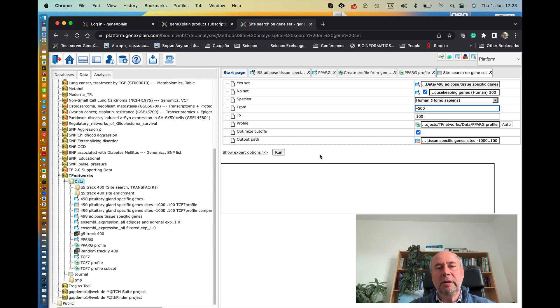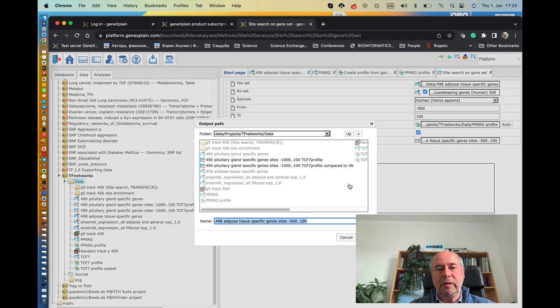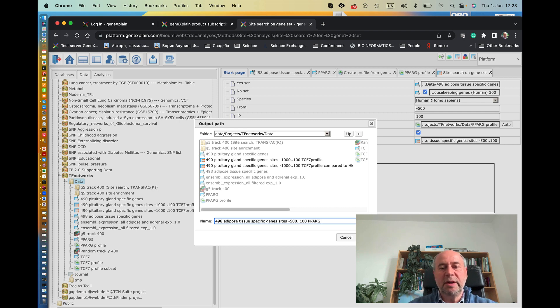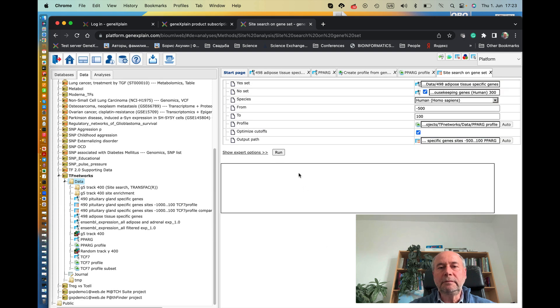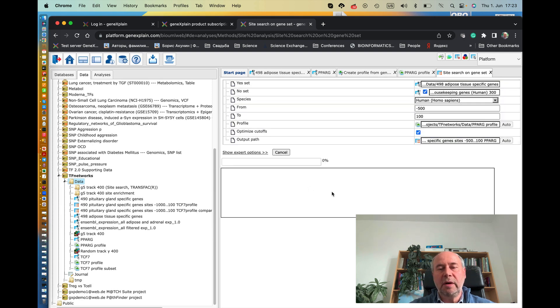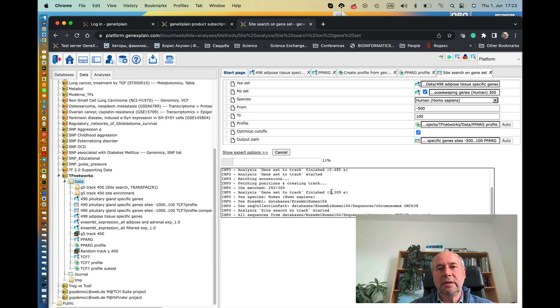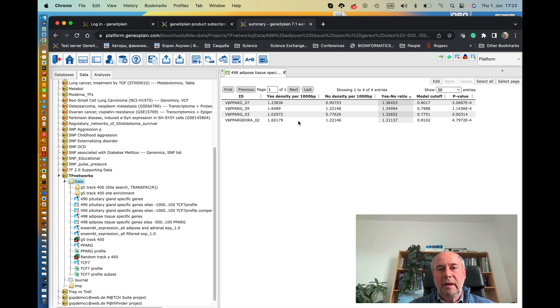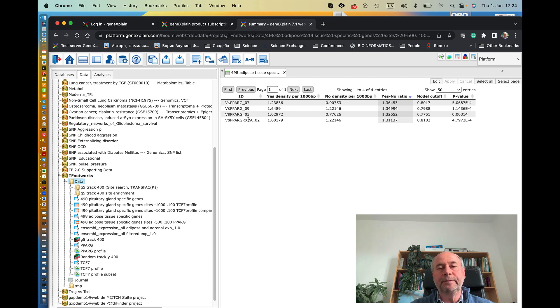And the only thing we have to now change is the output path. So it's adipose tissue-specific genes which were searched by PPAR gamma transcription factor for transcription factor motifs. So now we run this analysis. You can see the searches for these binding sites. And now it reports the frequency of the binding sites for these selected motifs.